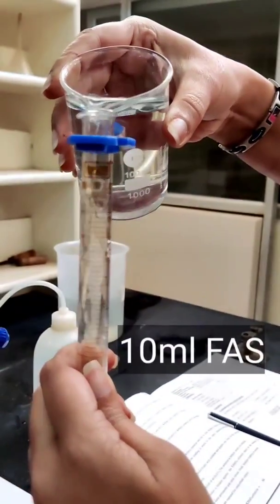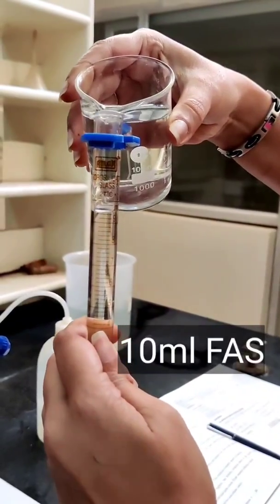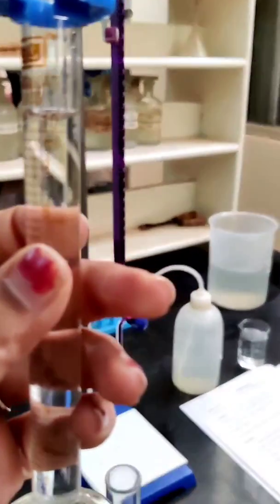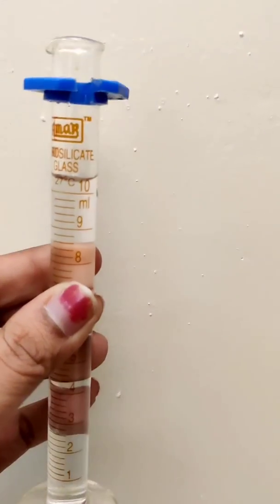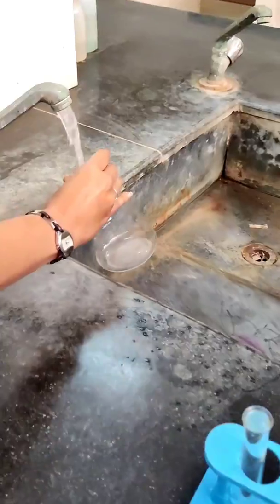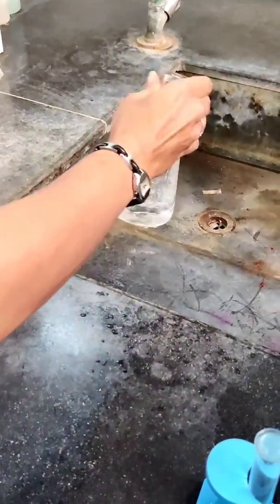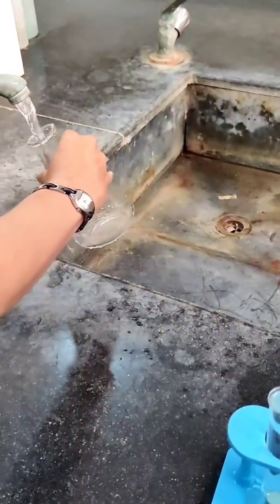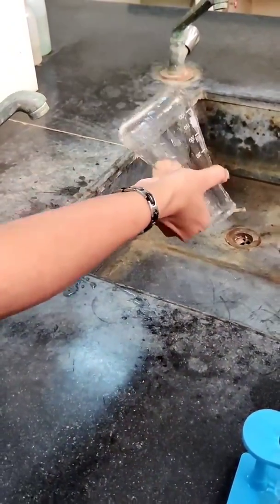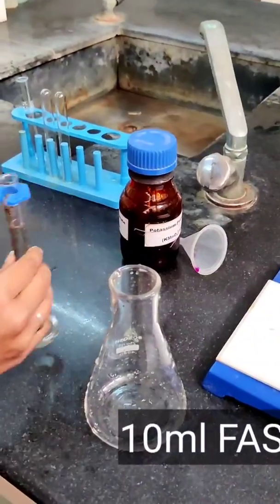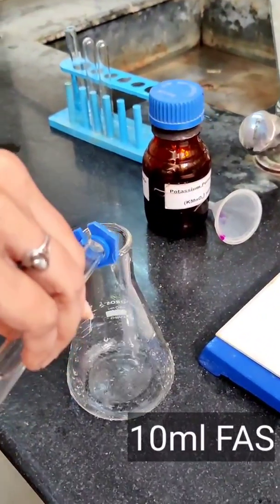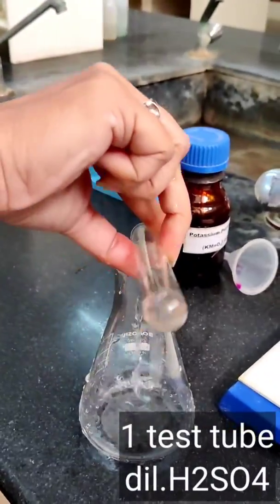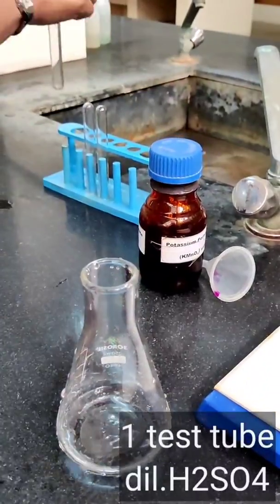Now, take 10 ml of FAS solution in a measuring jar. Transfer it into a conical flask. We are using a measuring jar instead of a pipette. Add one test tube of dilute sulphuric acid.